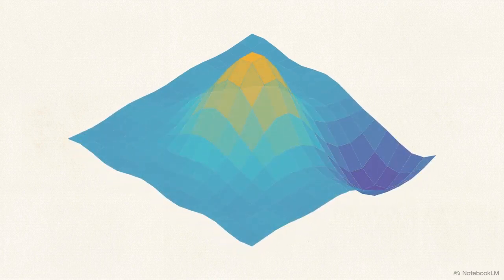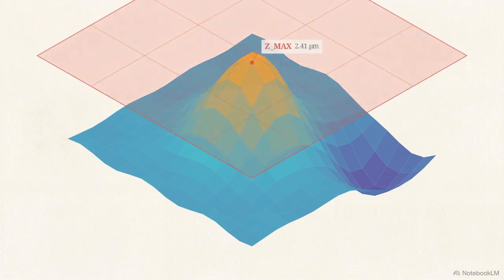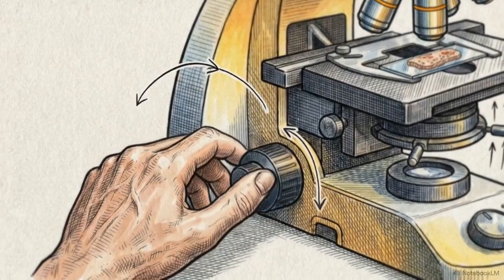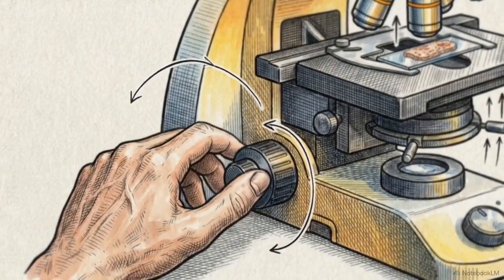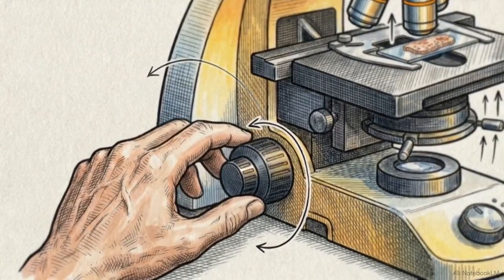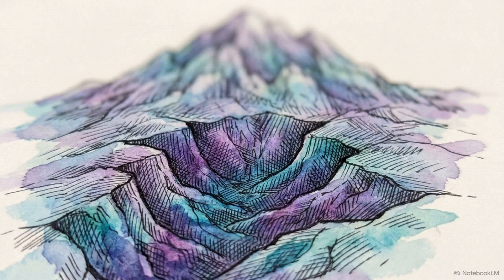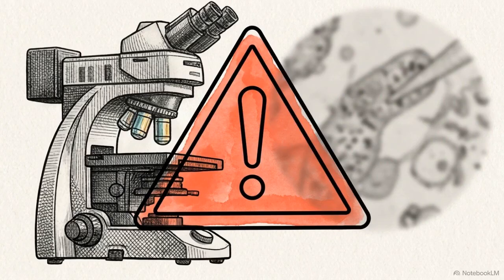To build an extended focus image, the software requires exact coordinates for the physical top and bottom of your sample. Using the microscope's motorized Z-axis controls, adjust your focus upward until the absolute highest structural peak of your sample is sharp. Next, adjust the Z-axis steadily downward. Locate and log the absolute lowest structural point that remains in focus.